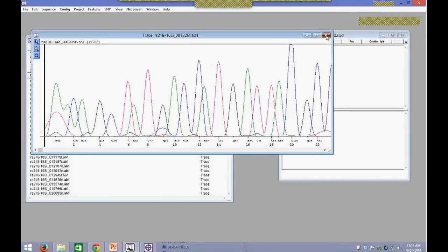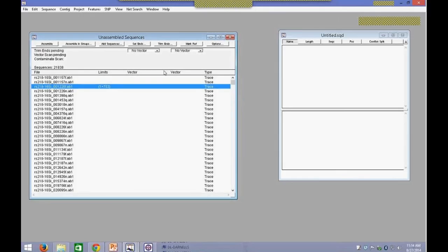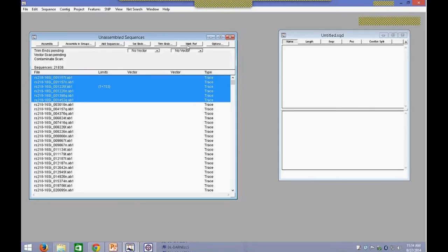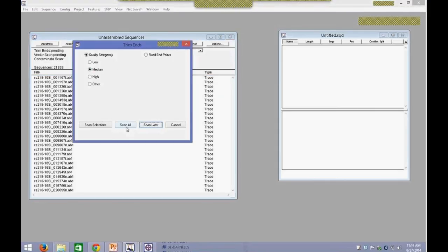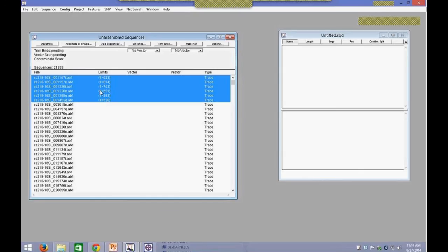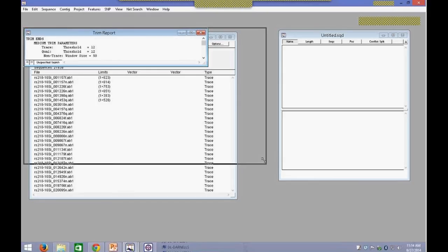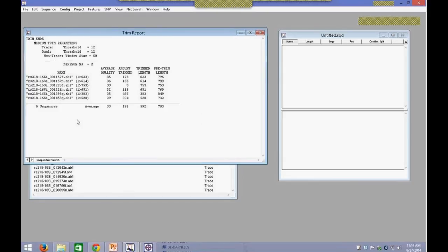You can choose to do end trimming before the assembly or during the assembly. If you want to trim your reads before performing your assembly, you can highlight the reads that you want trimmed and then go into Trim Ends and say Scan Selections or Scan All. If you do Scan Selections, it will perform the trimming based on quality, and you can see the updated limits. You can then go into Project menu and then Trim Report and look at the actual trimming that occurred for each of the sequences.